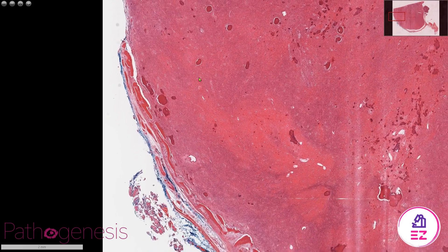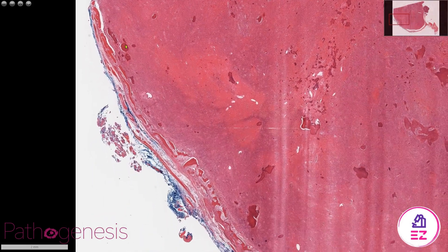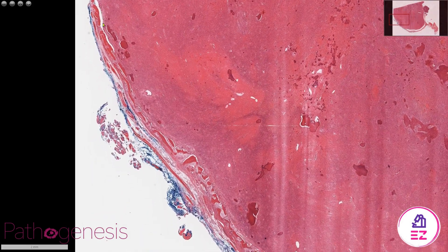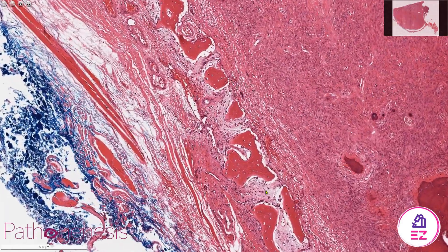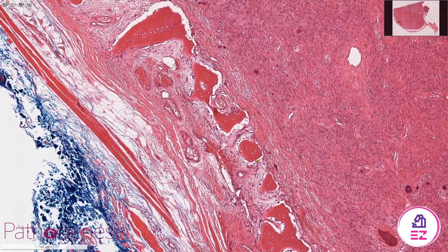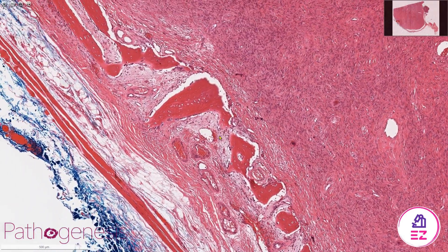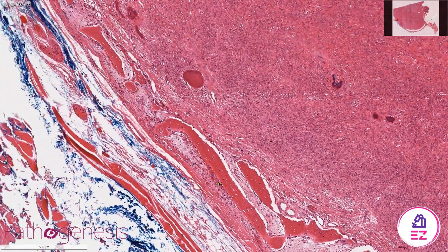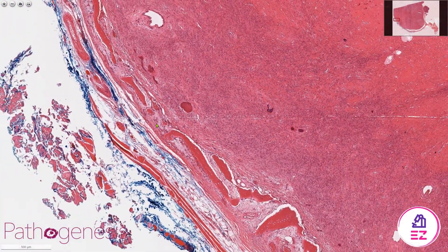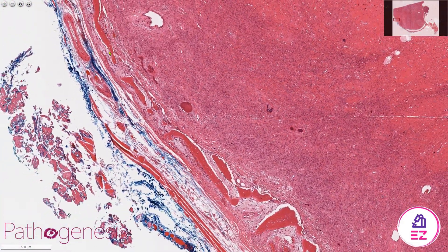If I zoom out, you can hopefully see that there's a well-defined edge to this lesion. Zooming in, we can see that that edge is formed by little islands of woven bone, and on the imaging that would correlate to the area of cortication around that well-defined edge.